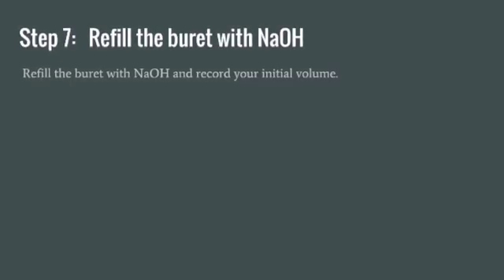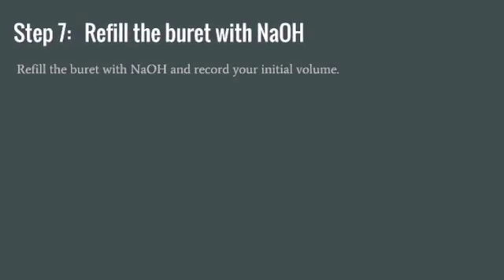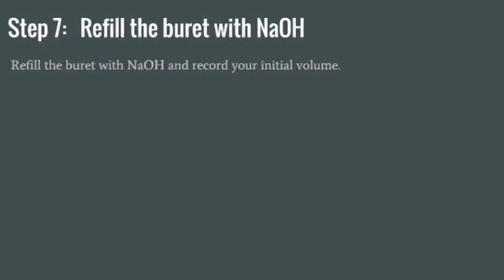For the next step, you're going to want to refill the burette with NaOH and then record your initial volume.